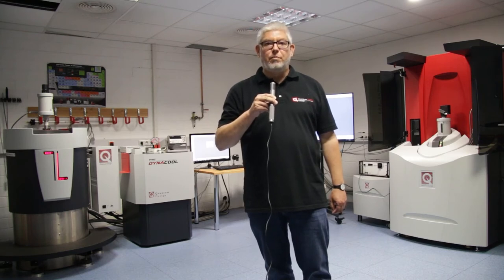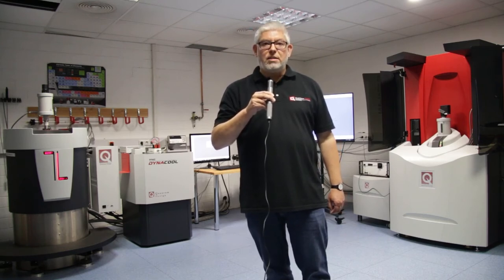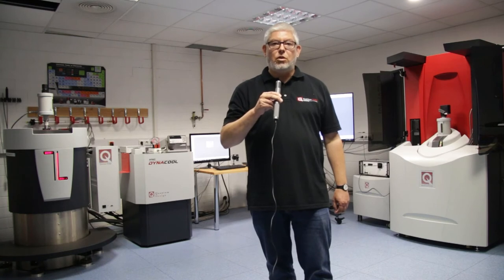We are going to measure a piece of floppy disk today, which is a sample providing a quite large moment. The goal here is to show you how easy sample measurements with the VSM can be made. In the next step we are going to prepare our sample to a sample holder so we can insert it into the apparatus later on.